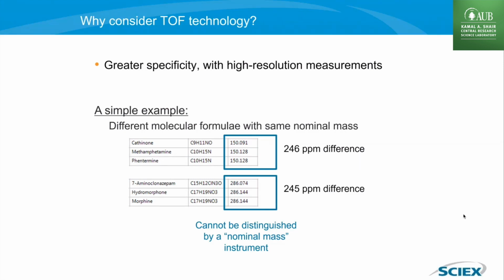We want to know, is there cathinone in the sample or is there methamphetamine? So we search for those two masses, and we can easily distinguish them, and then we could also get a ppm mass accuracy of how good the instrument is doing. So that would be, let's say, in that direction, you would be targeted, right? You know the compound, you know the formula, you're trying to say, is that mass present or not within the spec of the instrument, and could it be another compound, perhaps?